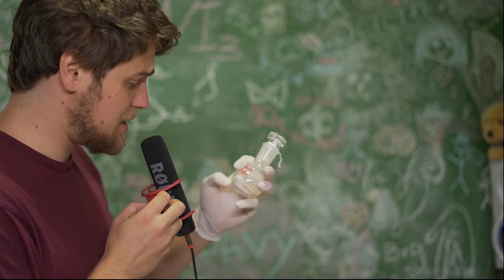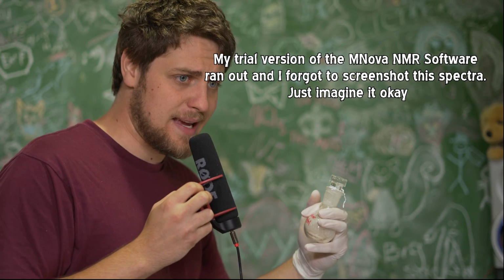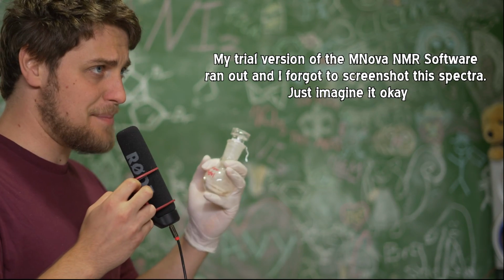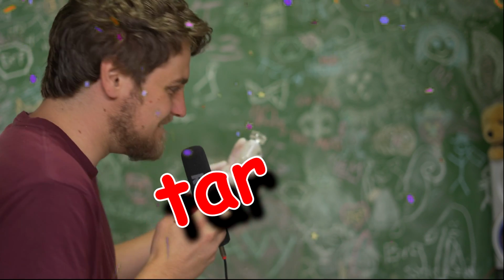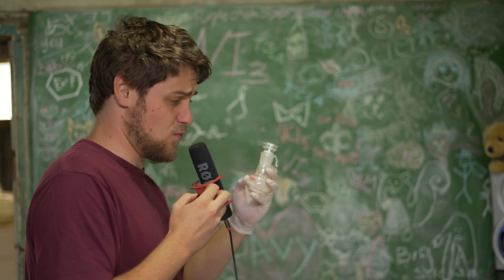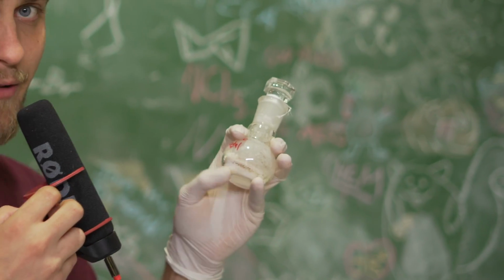The last bit of good news is the spectra of the darker compound, that, you know, enriched in the darker compound, actually has less MonoKetal in it, which didn't make much sense to me, but it really shows us that this dark compound isn't MonoKetal forming, it's really just tar. I don't think we're going to worry about the two different colors. We'll just run this for another couple hours. We've shown that we've done reasonable conversion efficiency with the method already. So we'll just run another couple hours, and we're not expecting it all to go this different color.